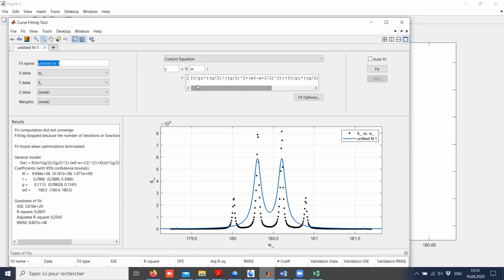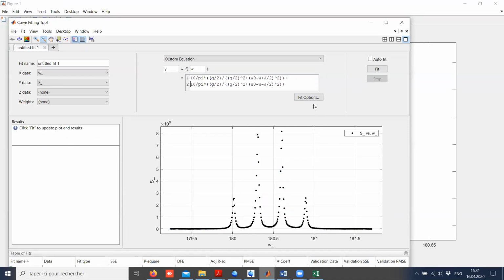So now what I have to add is, to make it clearer, make like this. So now I have to add the same thing. Now I'm including these two as well.